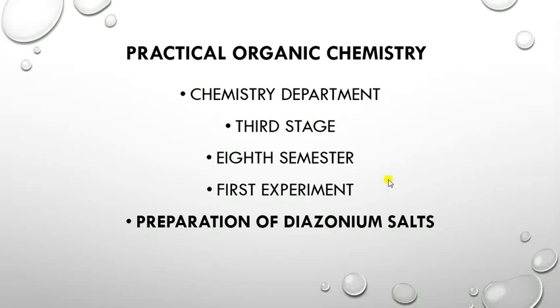Assalamu alaikum everyone. Dear students, you are welcome to the first experiment of the 8th semester of practical organic chemistry for the third stage. We'll start this semester with the preparation of diazonium salts experiment.